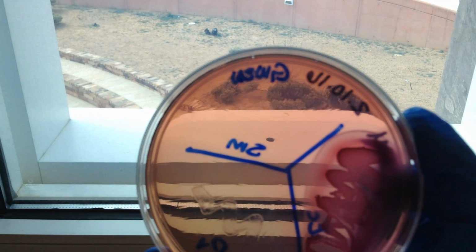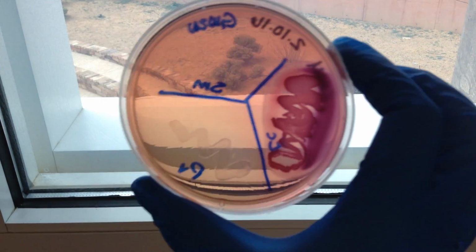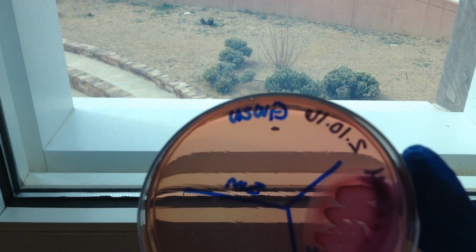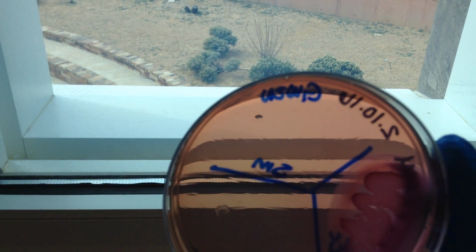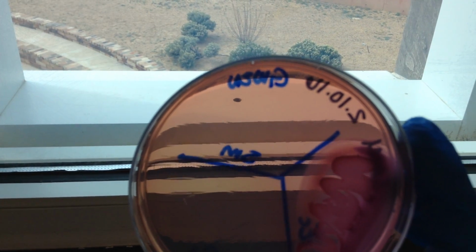Okay, so let's look at a third possibility when we put an organism on this particular medium. And in this area we see no growth. So compare that to the growth that we actually saw there with no fermentation, so you need to look very carefully. This would seem to indicate that the organism is gram-positive, and so therefore the crystal violet and bile salts interfere with its peptidoglycan layer and it's unable to grow. We can't really make any determination on its ability to ferment lactose because it didn't grow on this medium.